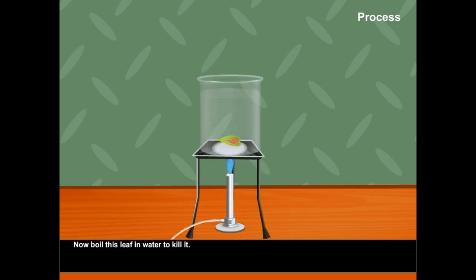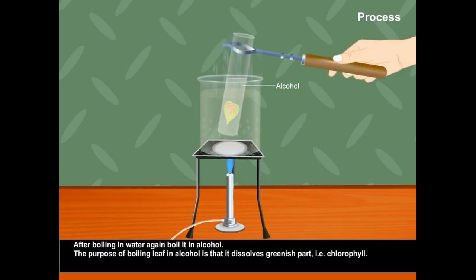Now, boil this leaf in water to kill it. After boiling in water, again boil it in alcohol. The purpose of boiling leaf in alcohol is that it dissolves greenish part, i.e. chlorophyll.